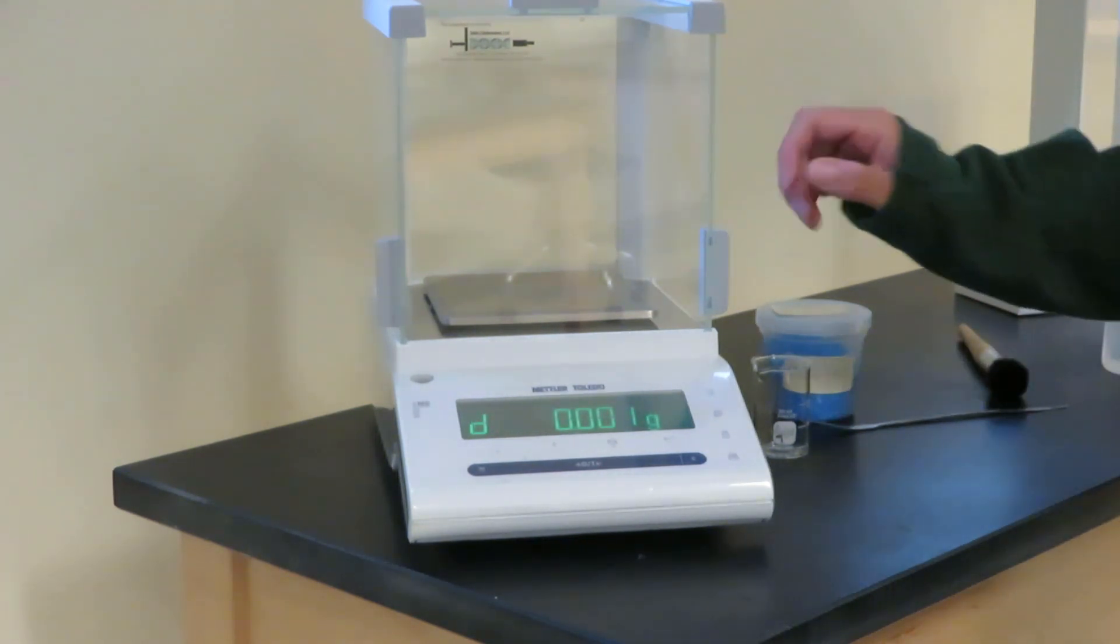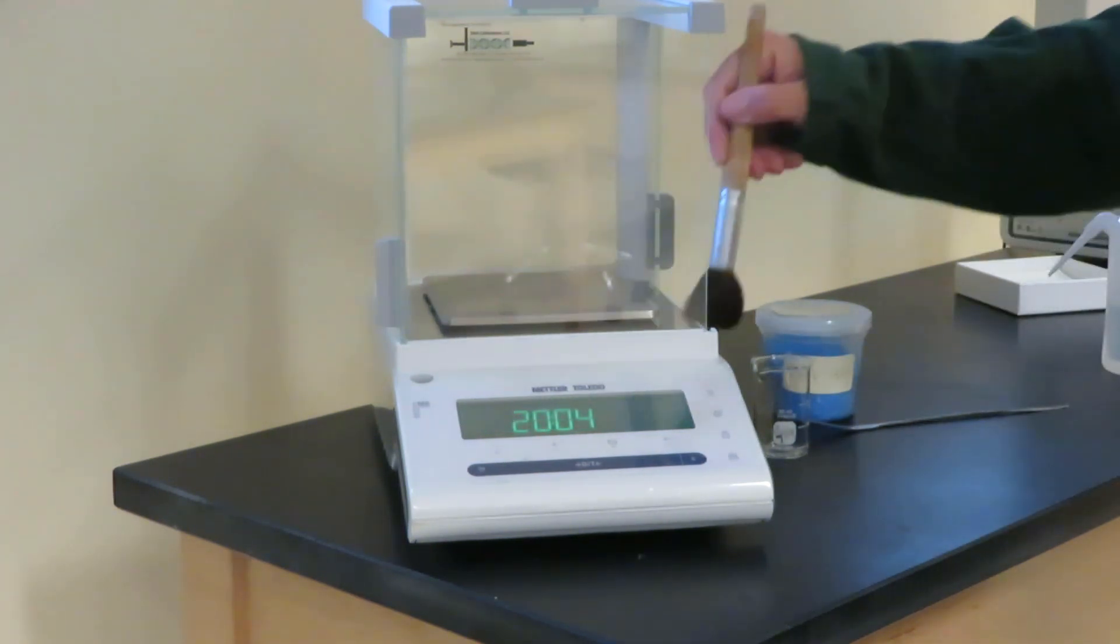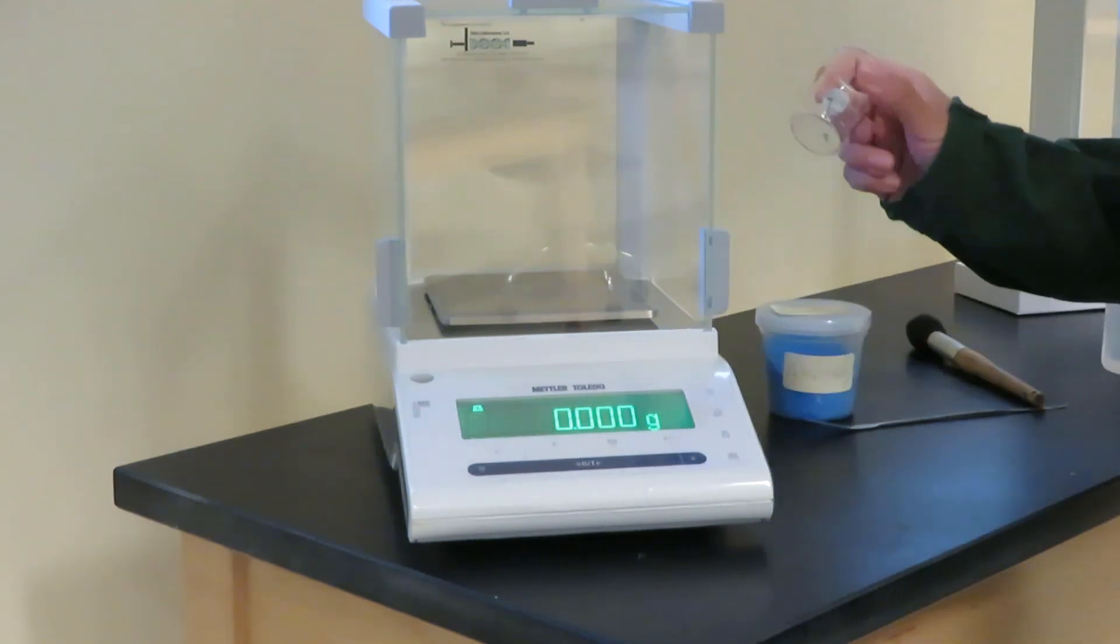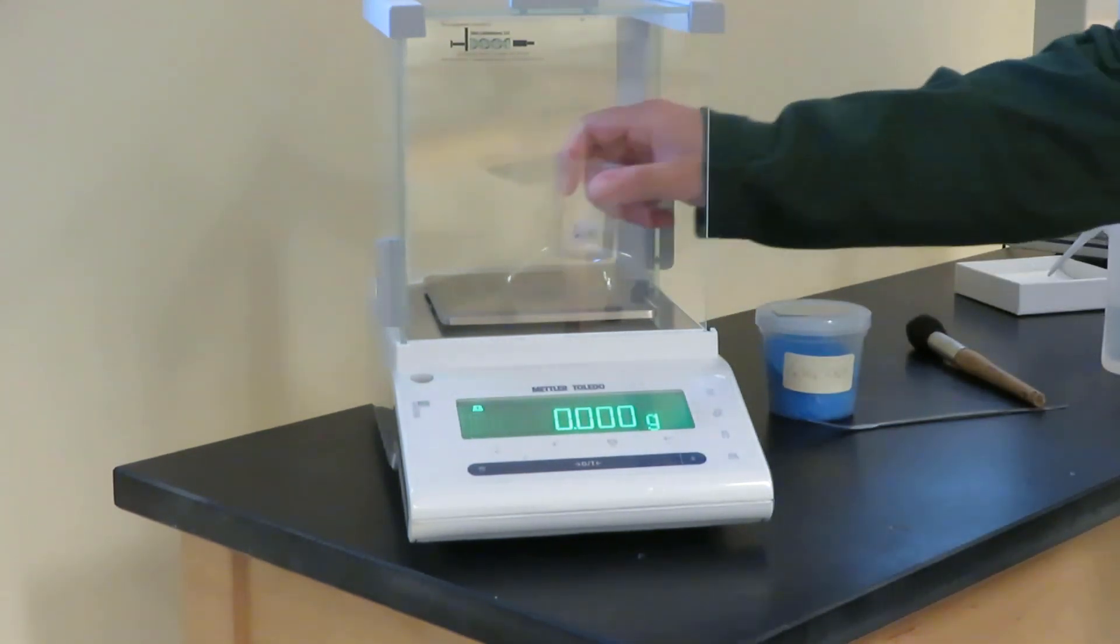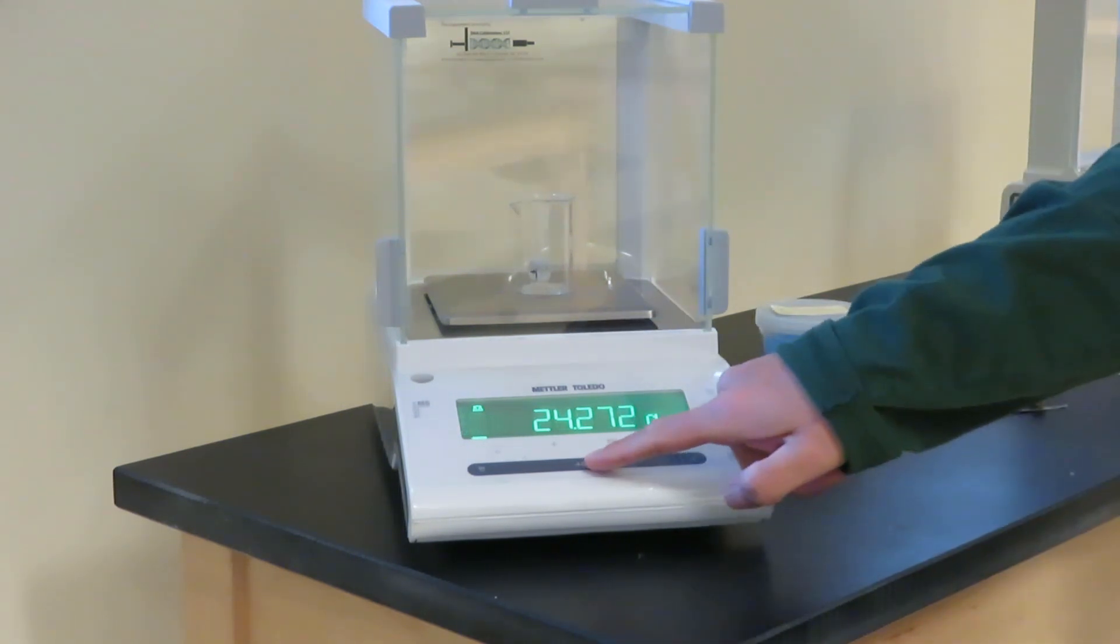What we want to do is weigh it on the balance. I'm going to make sure it's clean to start with, so I'll brush it. I'm going to weigh it into a beaker. I'll place the beaker, close the draft shield, and I'm going to tare it.